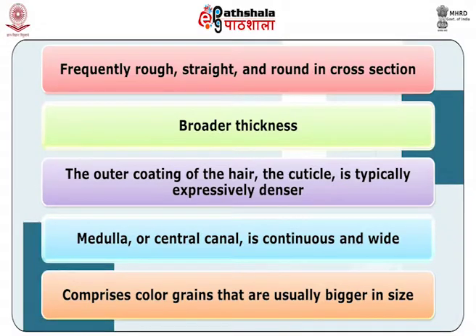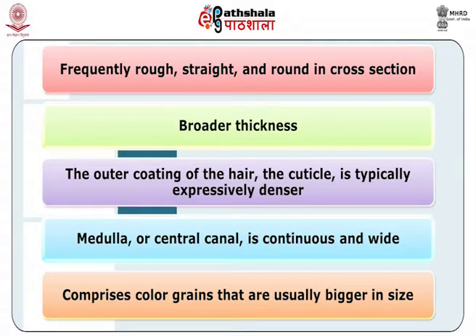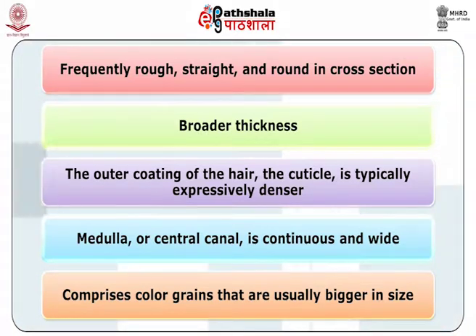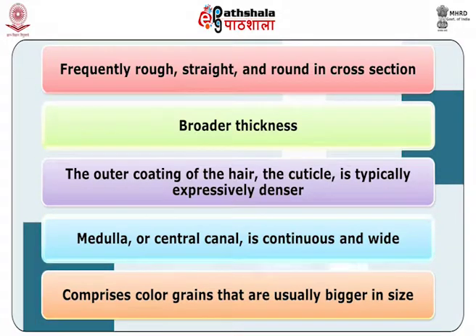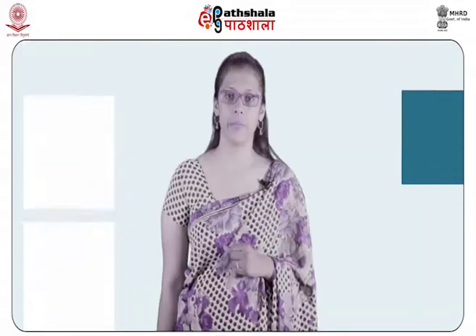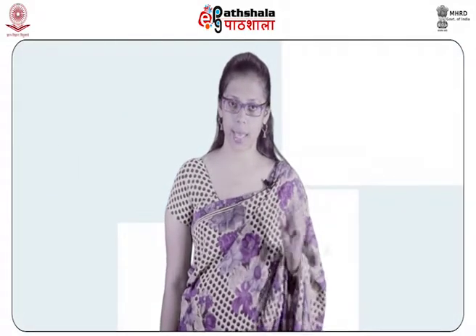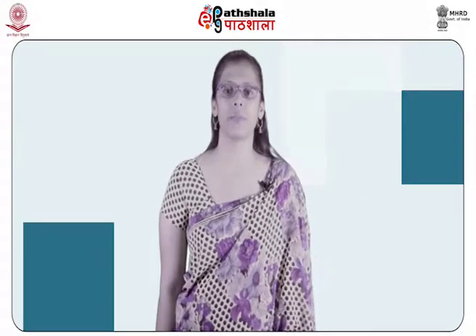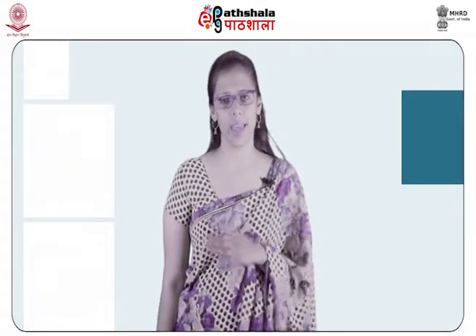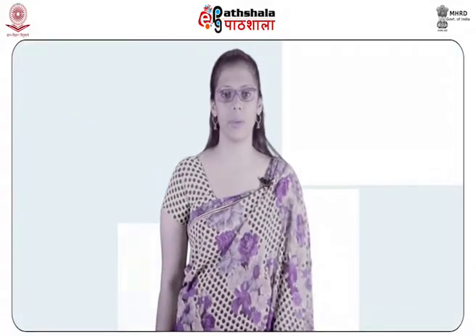The hair shaft or cortex of Mongoloid hair comprises color grains that are usually bigger in size than the color grains of Caucasian hair and which frequently appear to be assembled in inconsistent areas inside the shaft. Mongoloid hairs can have a distinct reddish look as a product of their pigment.